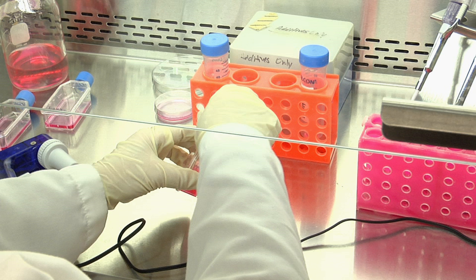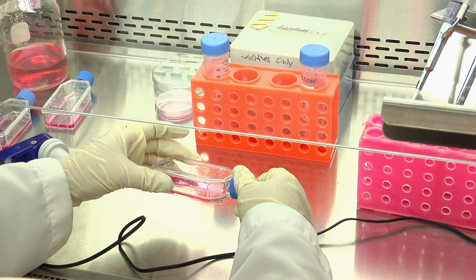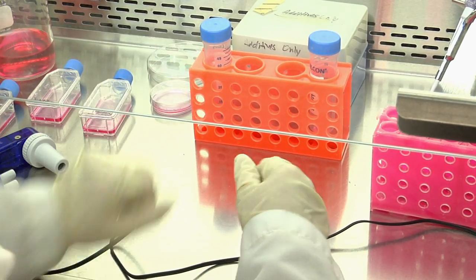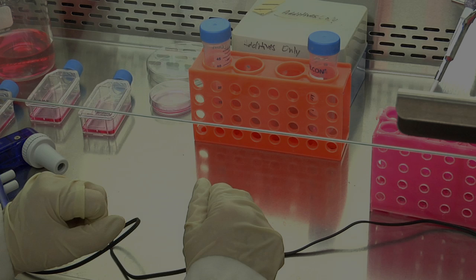Then, gently hold the flask horizontally and slowly rock it to spread the medium over the surface on which the cells are attached. Leave the flask on the flat surface of the hood in order to keep the cells in contact with the culture medium.